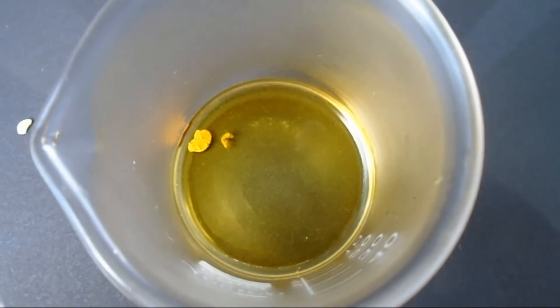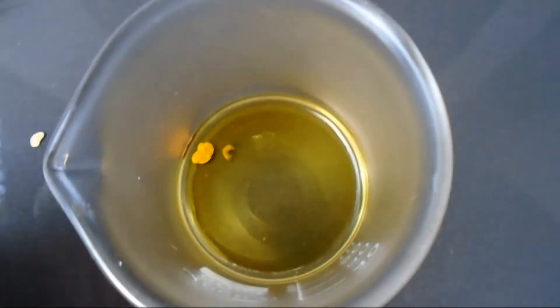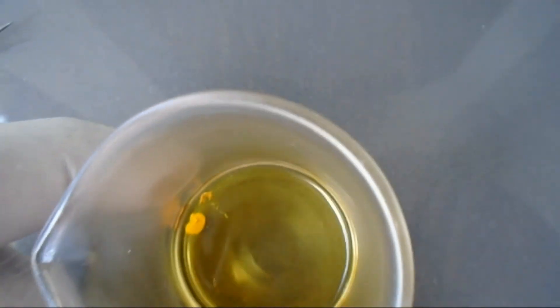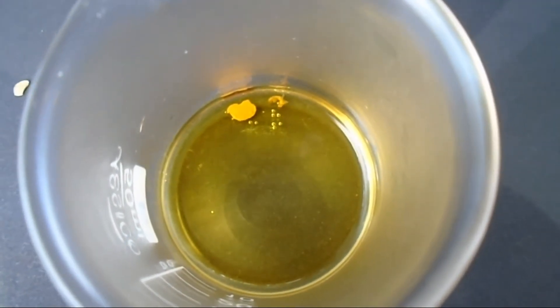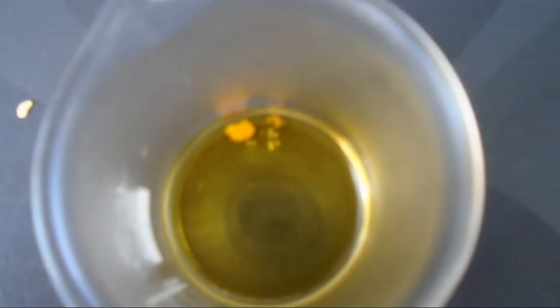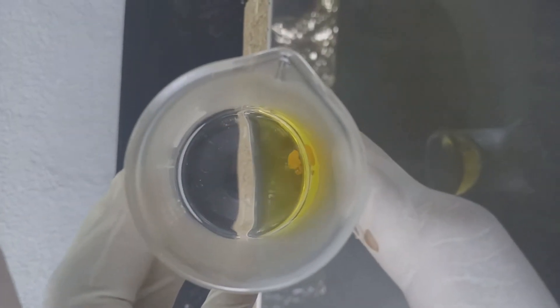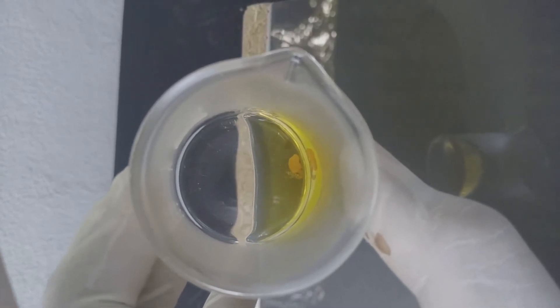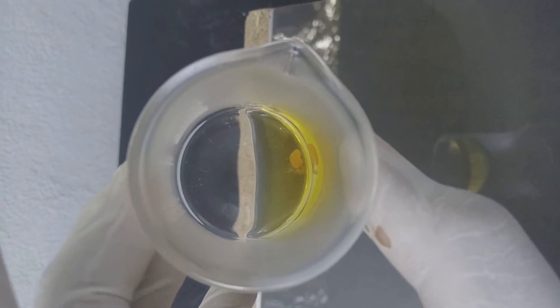Now you can see there is a very little reaction — the bubbles are coming out from the gold pieces. Now you can see the reaction: the gold metal is dissolving in aqua regia solution.